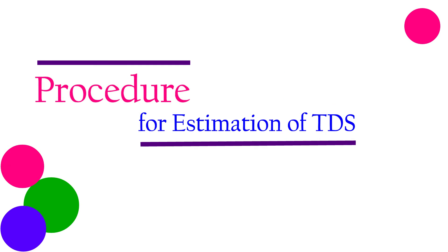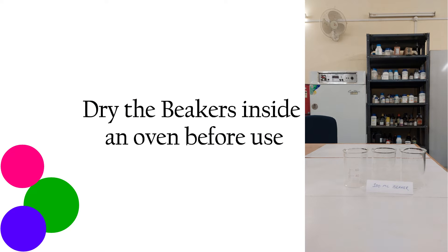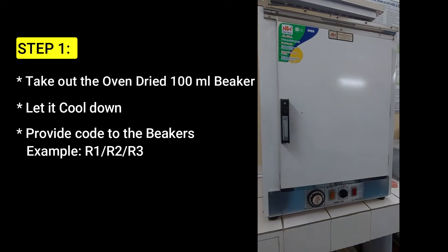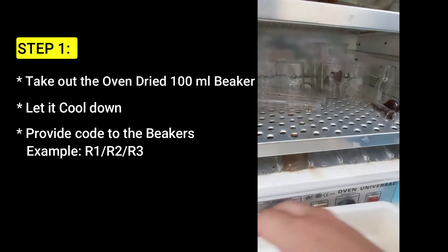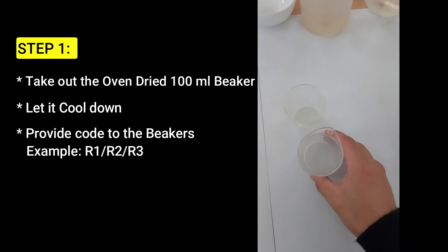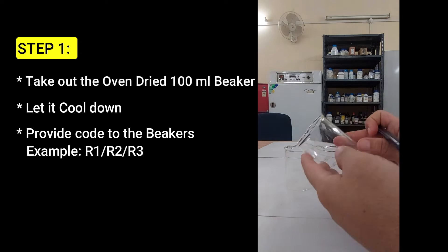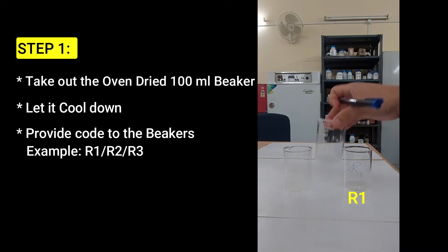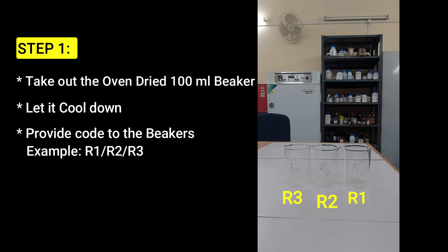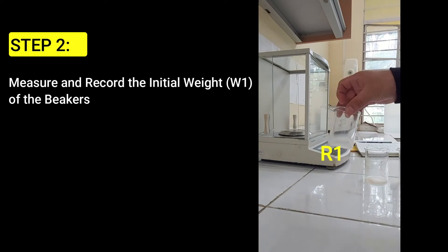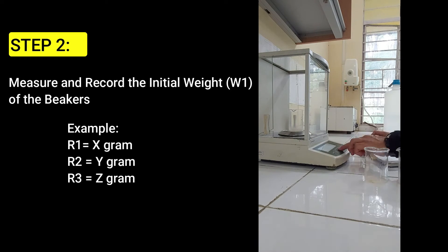Next, let's move on to the procedures for estimation of total dissolved solids. First of all, you have to dry the 100 ml beaker in an oven. After drying them for almost 24 hours, take out the oven-dried beakers, let them cool down, and then provide codes such as replicate 1, 2, and 3 to avoid confusion when analyzing many samples. Then measure and record the initial weight of each beaker.